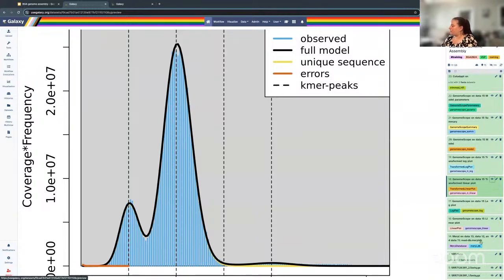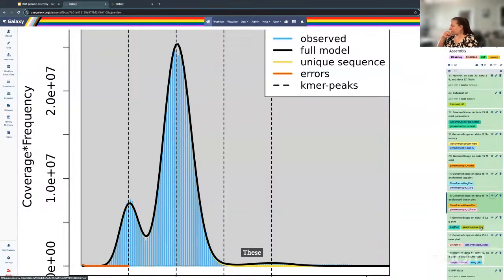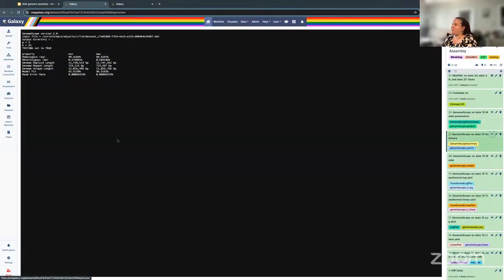So these are the main inputs of this workflow. And another important thing is all this data, you have it in text output, not just in image output. So we're going to use this text output to generate the estimated genome size and the average coverage, and these parameters we're going to use in later workflows as parameters for the contigging. Everyone good so far? I'm not going too fast? Perfect.